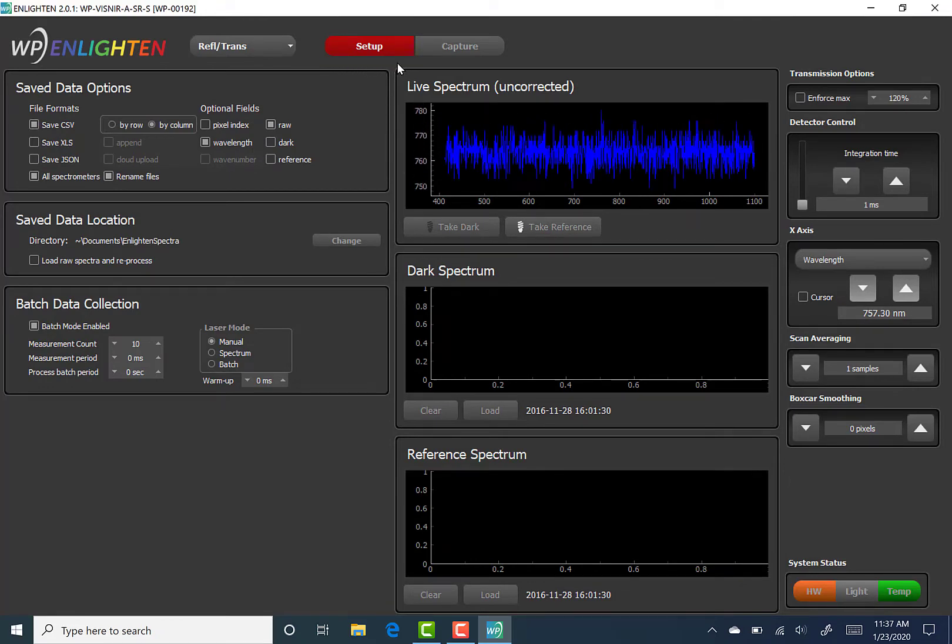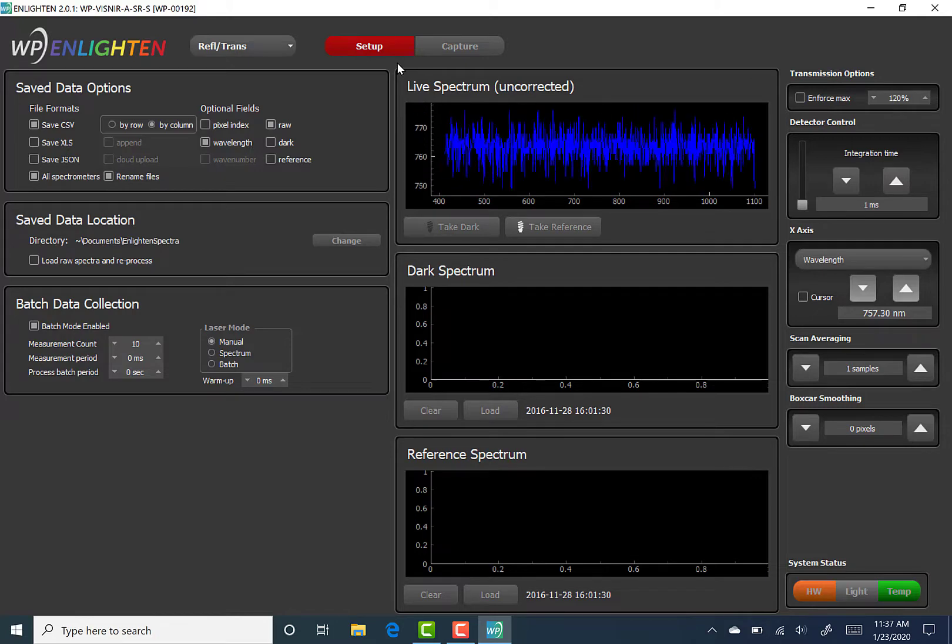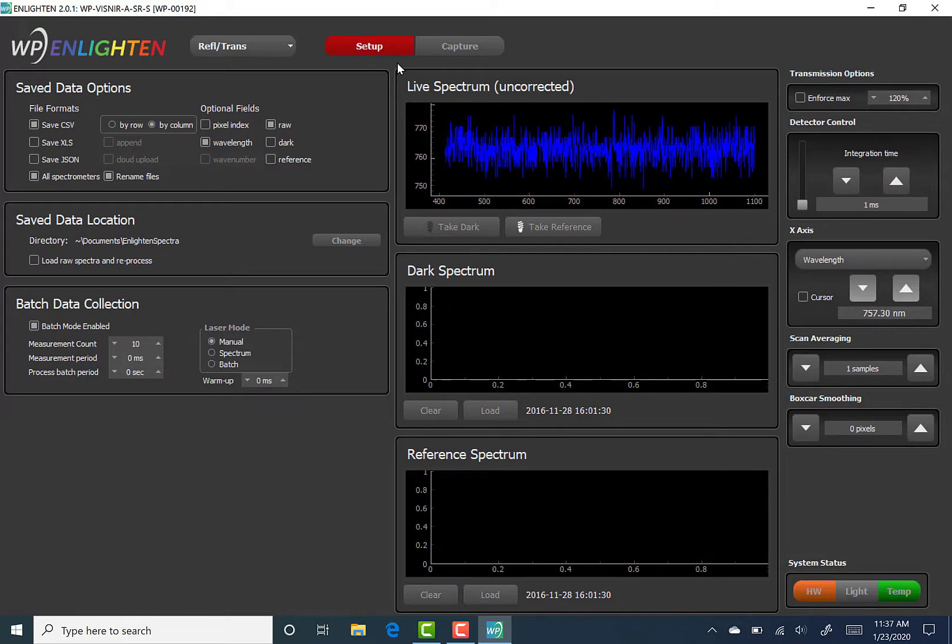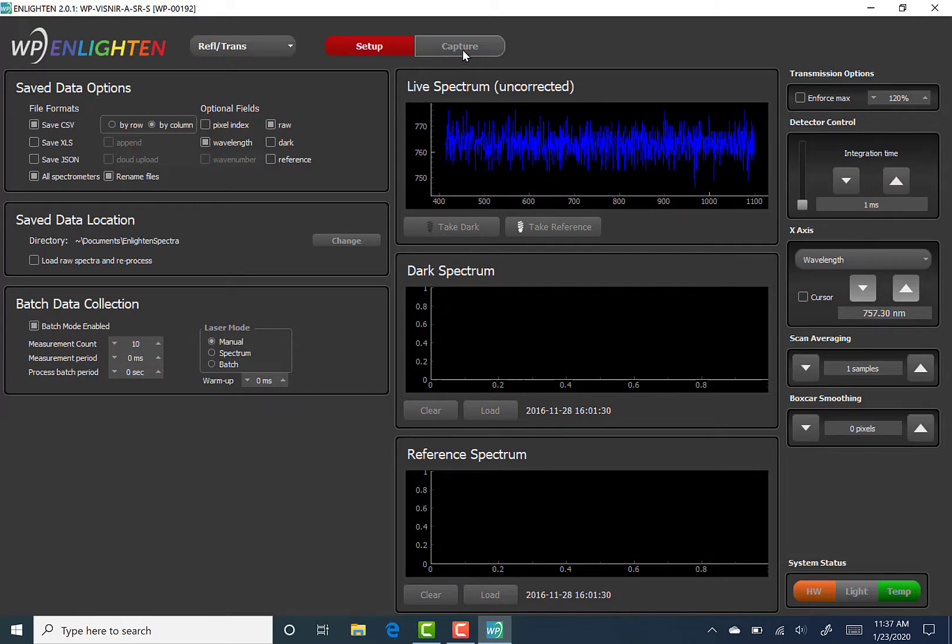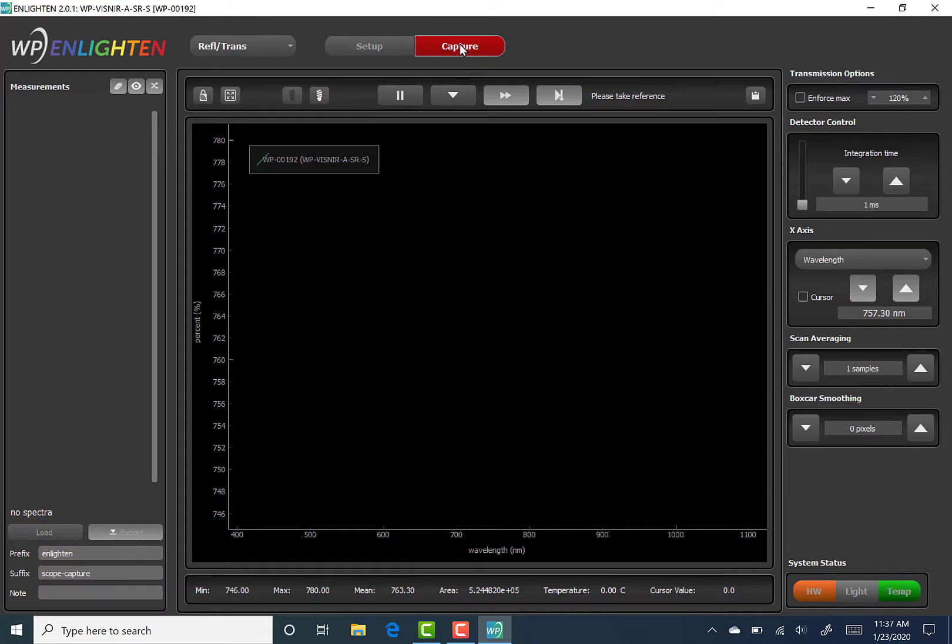Collecting a reflectance/transmission measurement will be discussed in much more detail in a future video, so for now, let's just switch back to the Capture tab so we can play with the Transmission Options Control.